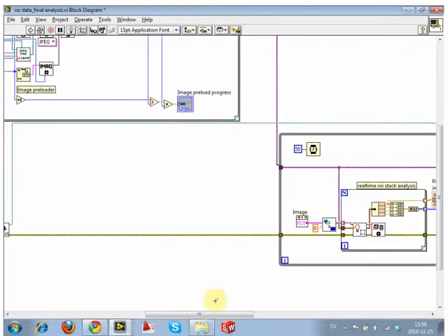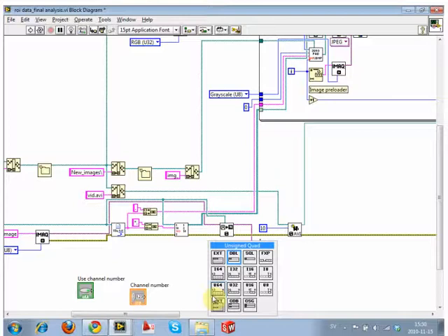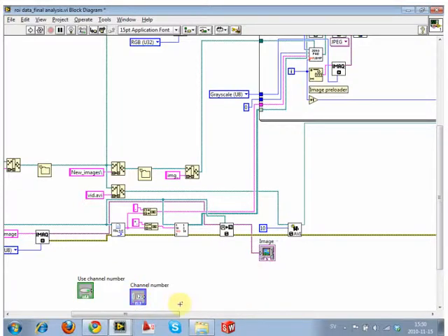So like we've shown previously, when you create channel things like that, they normally come up as a double precision, and we just want to change that representation to be some integer. So unsigned integer is fine. And we're concentrating on this section here.